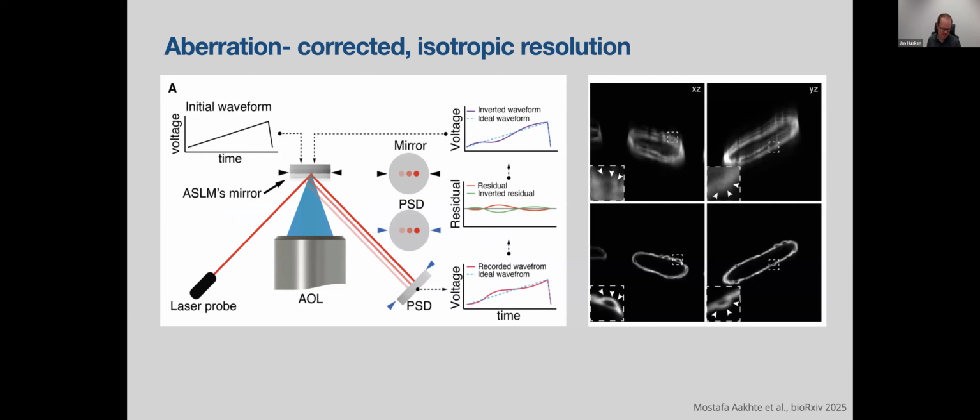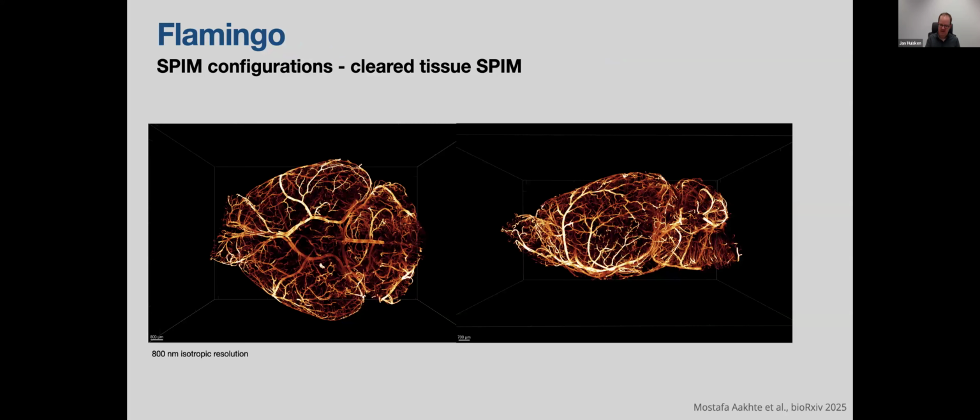And it's just phenomenal to see the quality of the data where you can really depict a centimeter-sized specimen, and you can rotate it in space, look at it from different directions, and you can't tell from which angle this specimen was recorded.